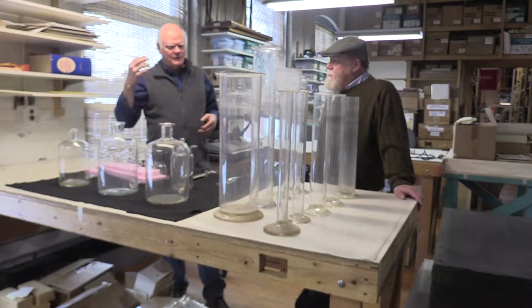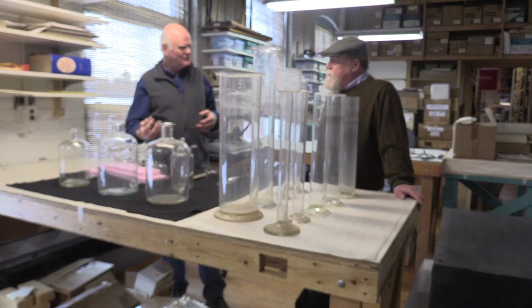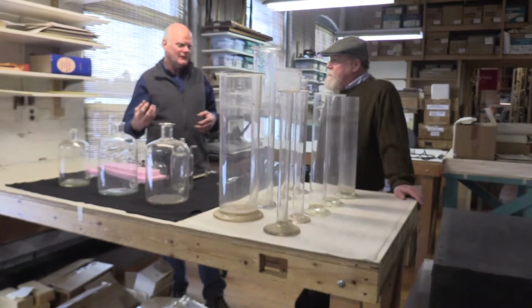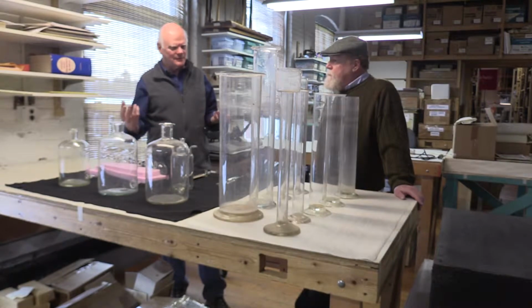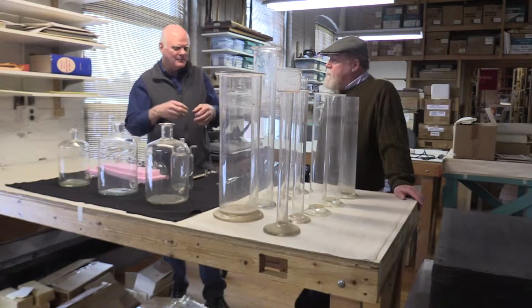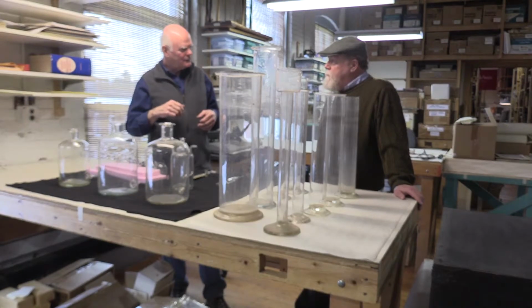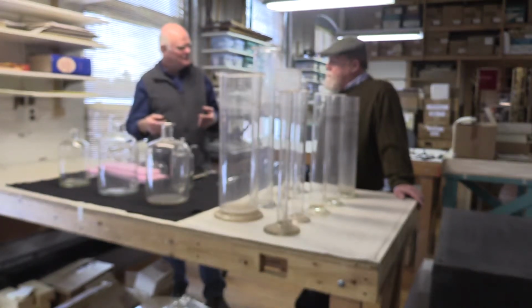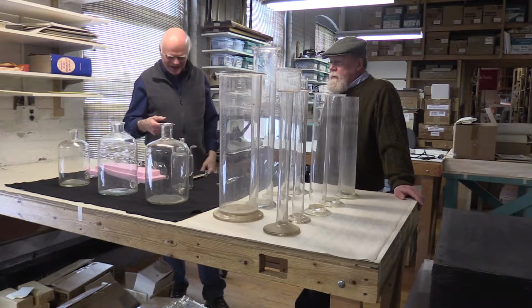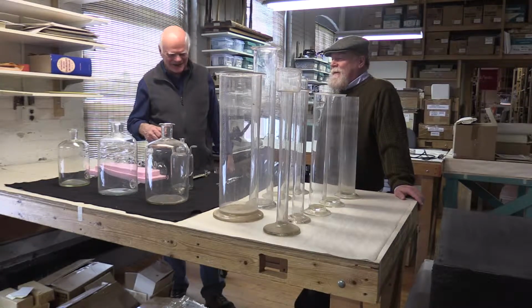When sugar imports were taxed, you had to figure out what the concentration of sugar was in a shipment. So often it came in as a syrup. They developed pieces of apparatus that you could take a sample from the hold of that ship, put it into the apparatus, and figure out the concentration of the sugar and calculate the import duty on that shipment. Oh my God. So the taxman's always one step ahead of the scientist. And the scientist always seems to be very happy to help along, unfortunately, in some cases.